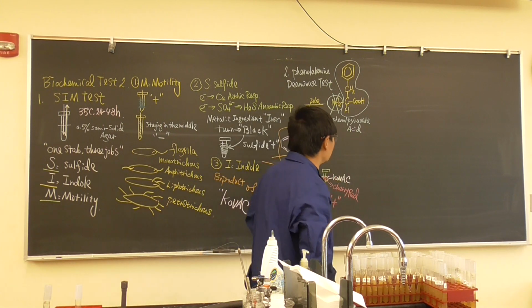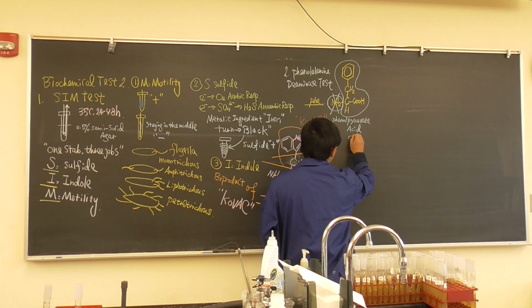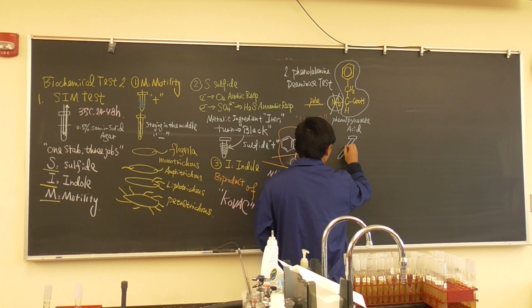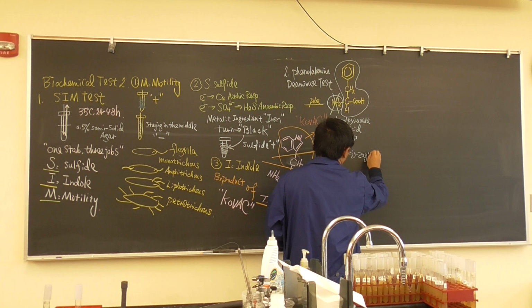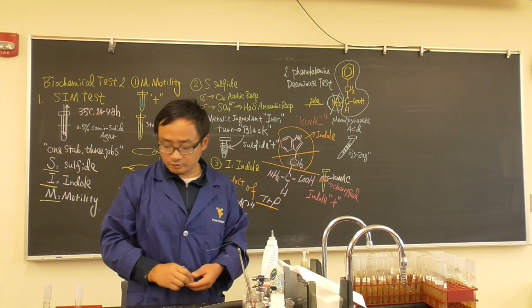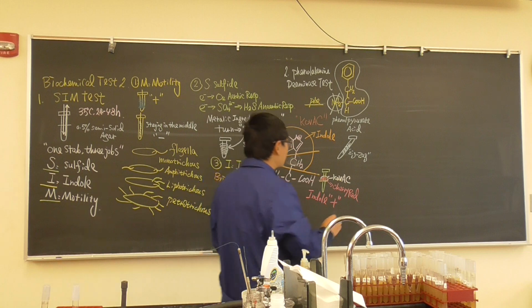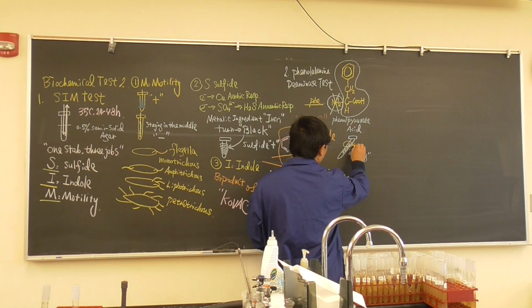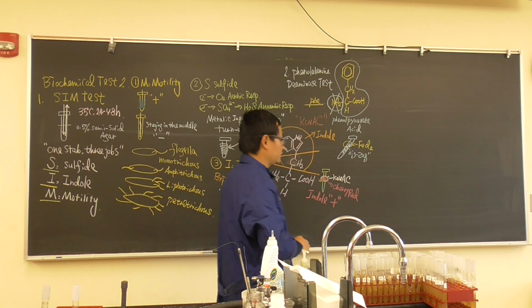Okay, how do you know it is phenylpyruvic acid positive? How do you know it's deaminase? The work is very simple. You get a slant, and then you do a zigzag streak. How do you know it is positive? We should do a confirmation test, which is next week. We need to add a drop of FeCl3, ferric chloride.